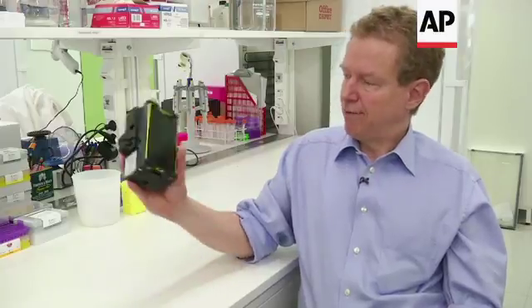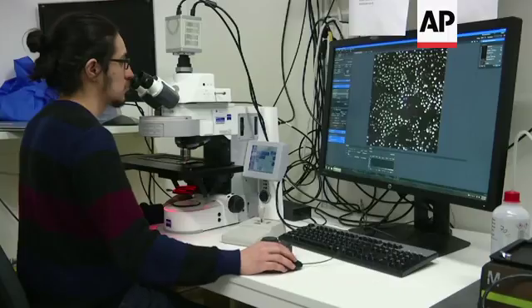DNA analysis technologies require instruments that require a lot of electricity power, and you have to put them into different infrastructure. This is self-operating. There is not a single cord connected to it. So I think this is the major impact of this thing. One can think of application in really remote areas all over the globe. You don't really need any infrastructure.